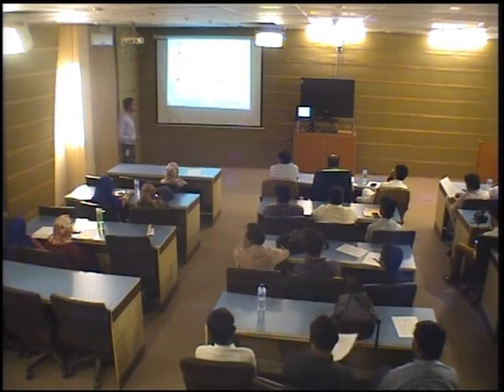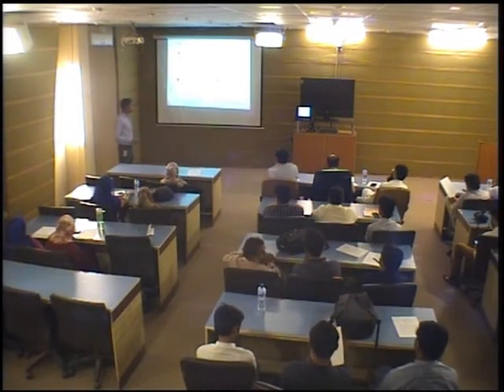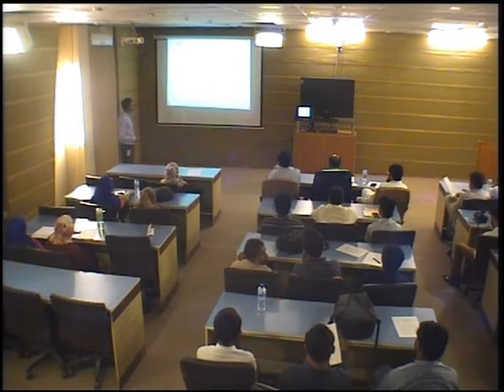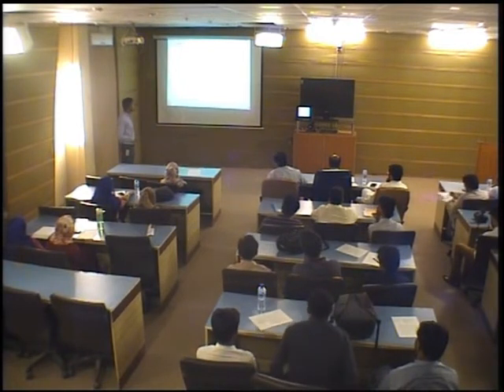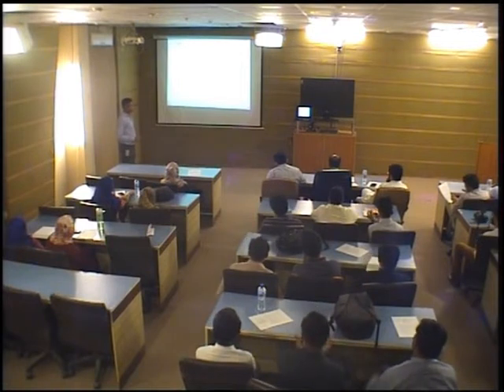In figure H, it starts from 648 to 672. We have observed 3 calcium lines and 1 hydrogen line. Meanwhile, in figure I, it's ranging from 700 to 710 to 735. We have observed calcium lines.